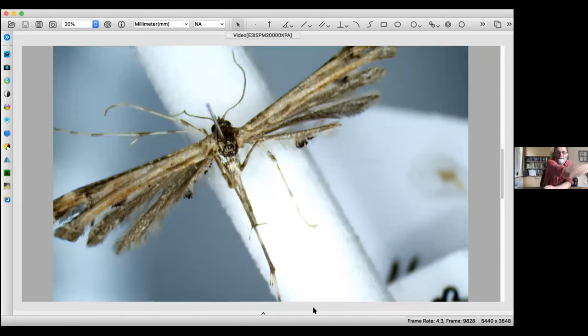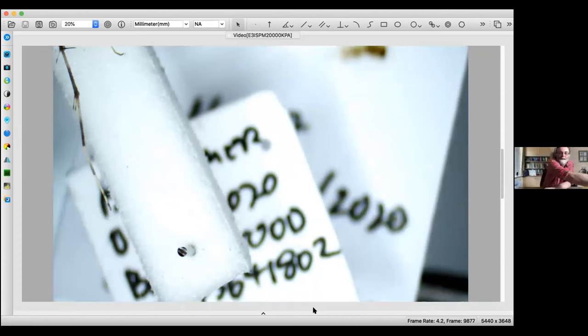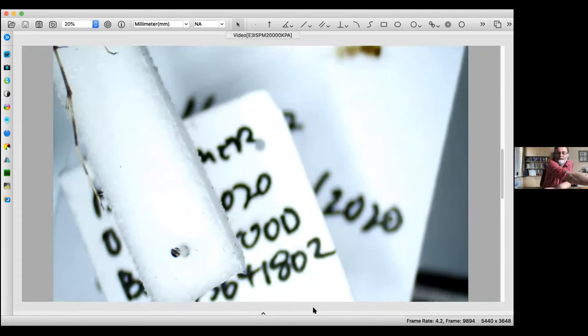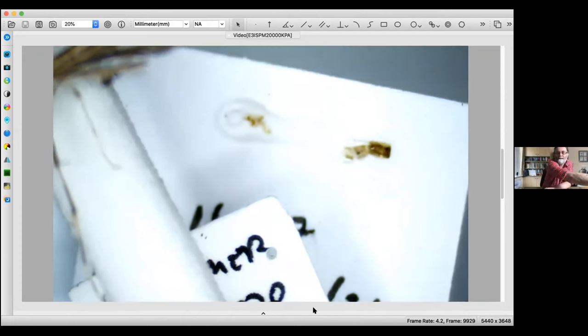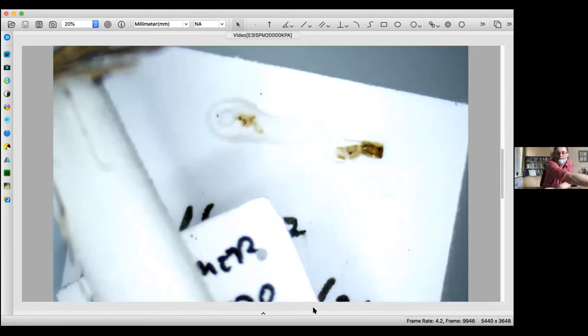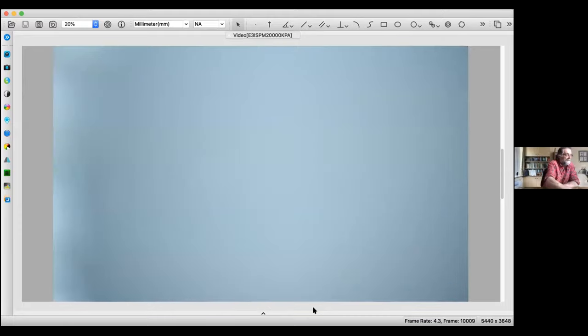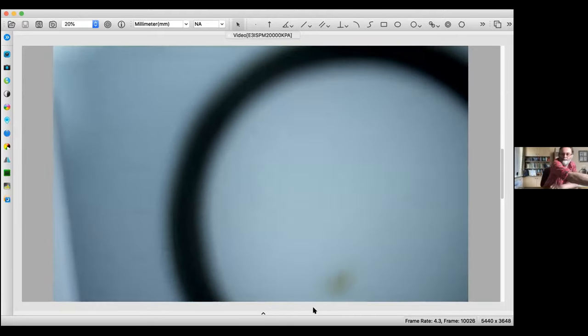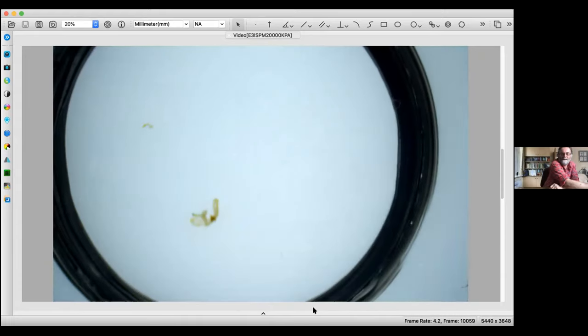At minimum magnification you'll notice that I've got a couple of labels attached. One label has my details and the specimen information. The other label on a much bigger card underneath has actually got some bits glued to it — those are the dissected bits of the moth that I use to confirm the identification. If I prepare a microscope slide, those would be the bits we would use.